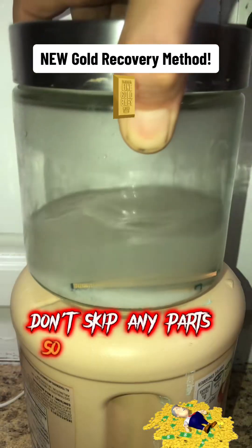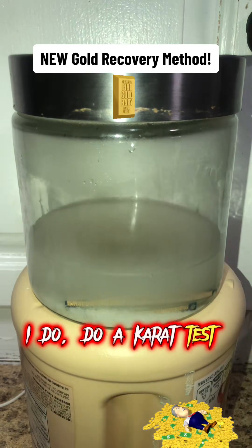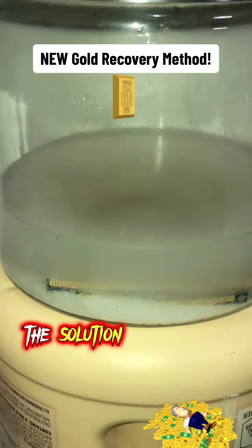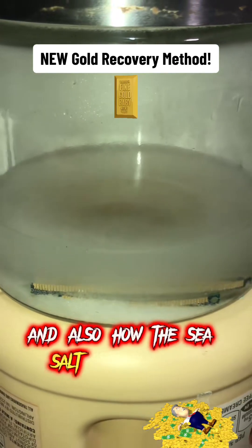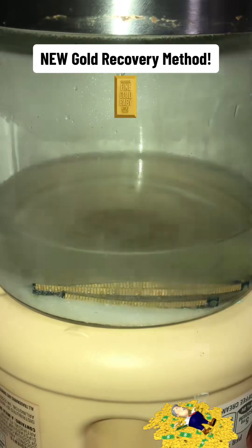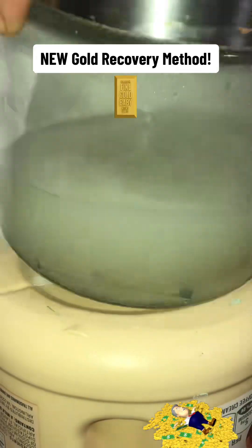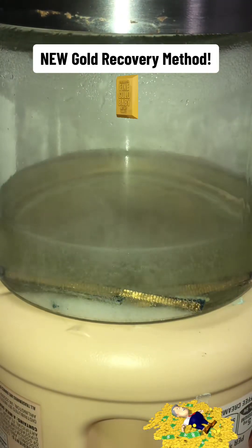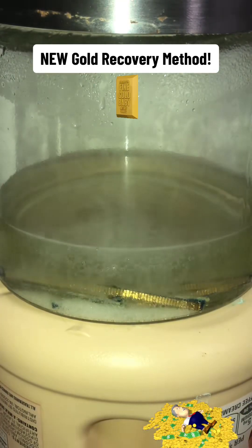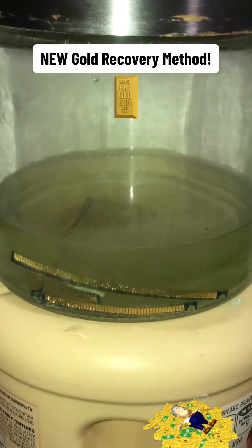Watch the full video. Don't skip any parts so you don't miss anything. In two hours you'll have 18 karat gold — I do a karat test at the end of the video. I will be speeding the video up here in a second but I want you to pay attention to the color of the solution and how it changes, and also how the sea salt is vaporizing.